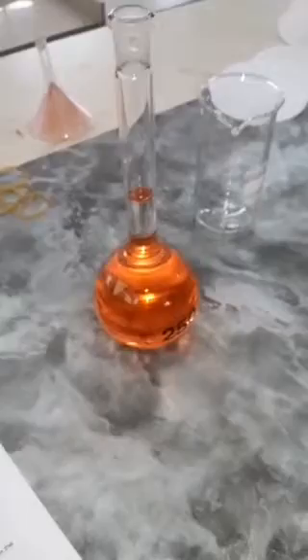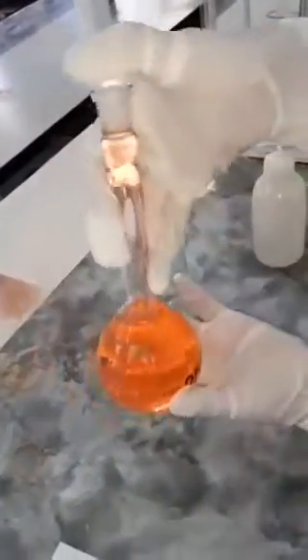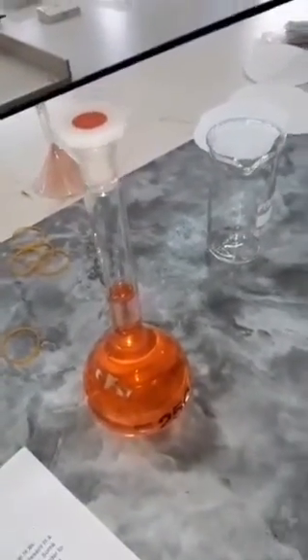Okay, so now I'm going to cover it and mix it thoroughly. So I'll cover with a stopper and mix it. Mix the solution thoroughly. Okay, so now after mixing, we are now going to start our titration.